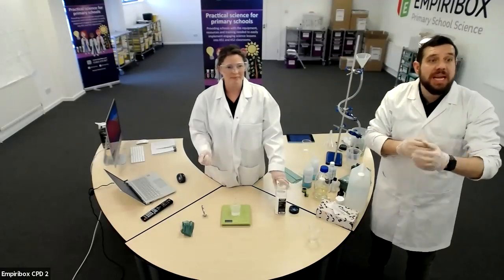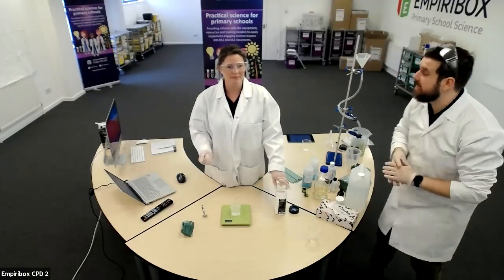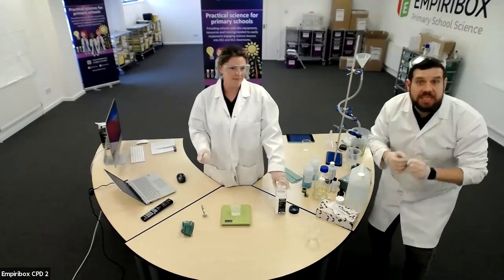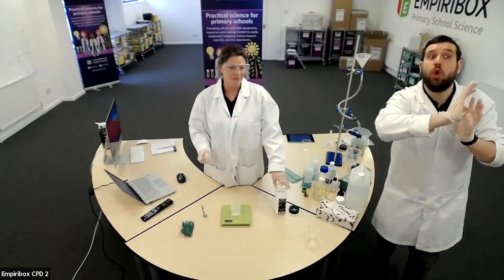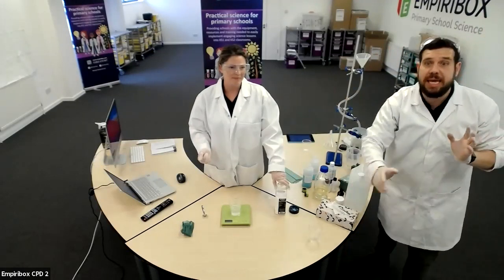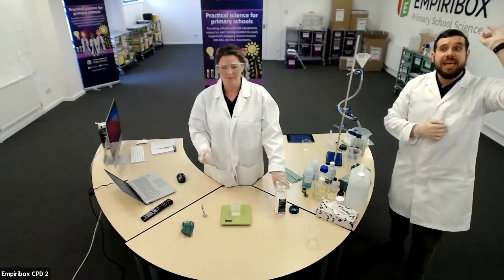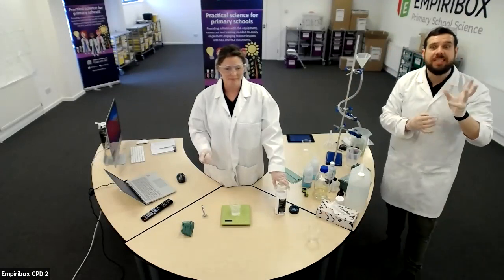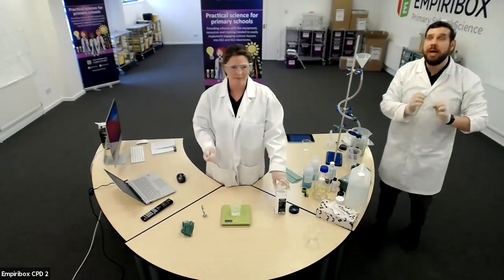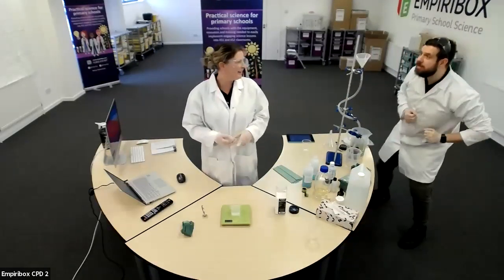So for every minute, just quickly check and see what your reading is on your total mass. Has it increased, decreased? But don't forget, I want you to use your observation and record everything that you see. As Sarah has said, do you see bubbles? Do you see a color change? Do you see light? Do you feel heat? All these things you have to record so you know a reaction is taking place. Now, Sarah, don't forget about the skills.